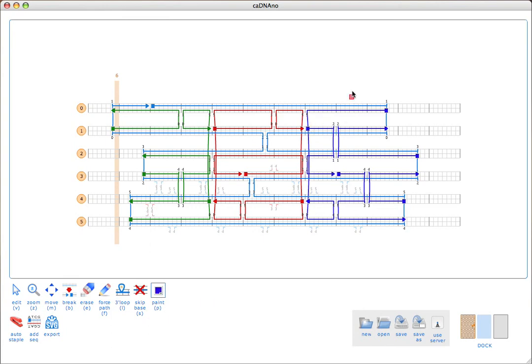So that speeds things up a little bit when you're just picking random colors. I'm going to save talking about the more advanced editing tools for a future tutorial. The last thing I want to show you is how to export our design in SVG and X3D formats.